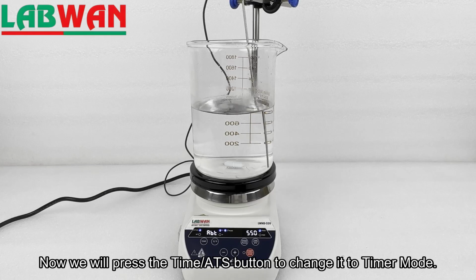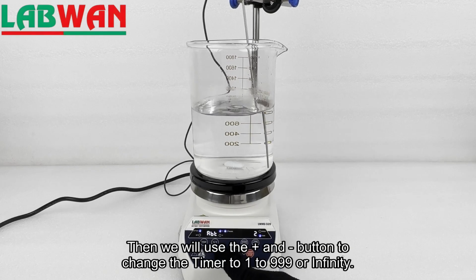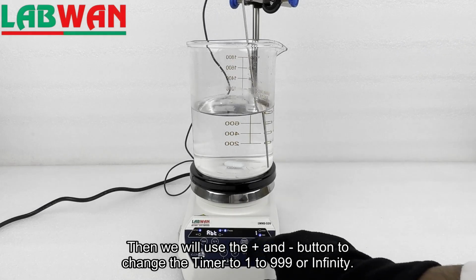Now we will press the time, ATS button to change it to timer mode. Then we will use the plus and minus button to change the timer to 1 to 999 or infinity.